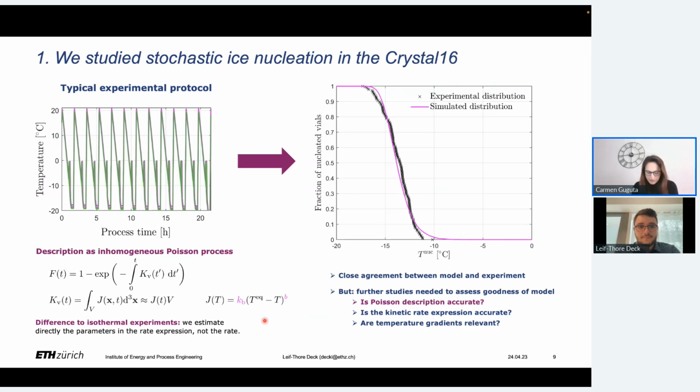But I do not recall right, I think they were about 80 cycles, a minimum of 80 cycles related to that. I see you have just above 20. How much did you use here, and what can you say about that?